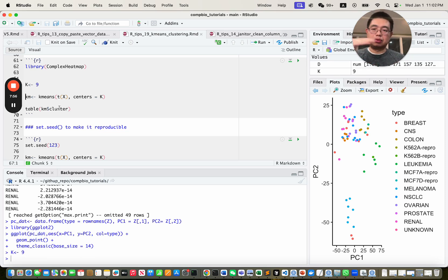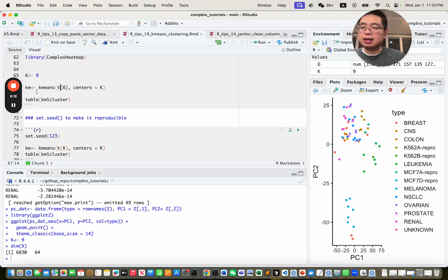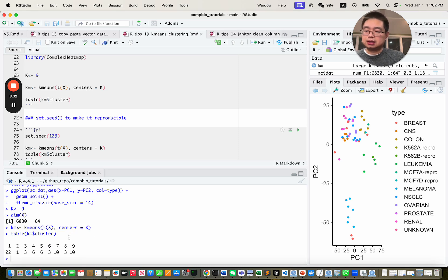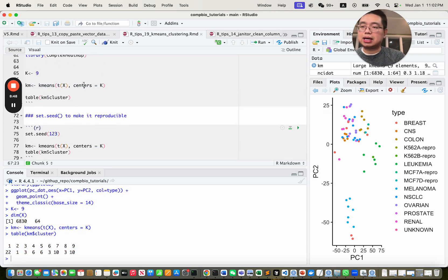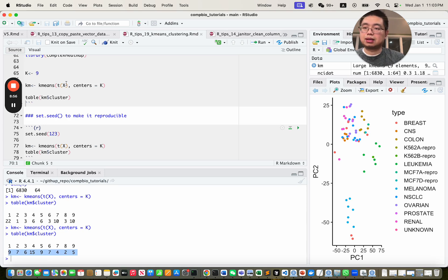In R, you use the kmeans function on the transposed x matrix with centers equal to k. If you run k-means multiple times, you'll notice the results change slightly each time because of the random initialization of the central points. That's why you need to use set.seed with any number to make it reproducible.